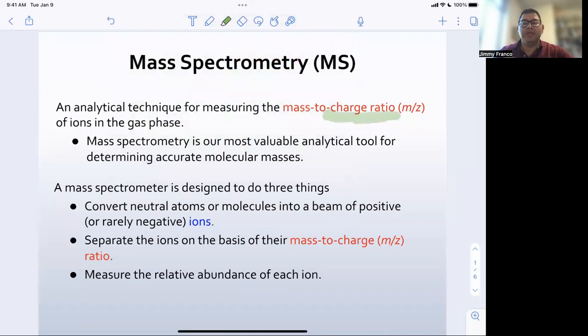And the problem, especially as you move into biological molecules, is sometimes it can have multiple charges, right? So if something has a charge of 2, then remember, you're actually going to cut the mass in half, right? So you can have these giant proteins that actually would be thousands of molecular units, but because they have a bunch of charges, you actually see the mass be relatively small. So just be really, really careful that it's the mass to charge ratio and that Z is representing the charge.